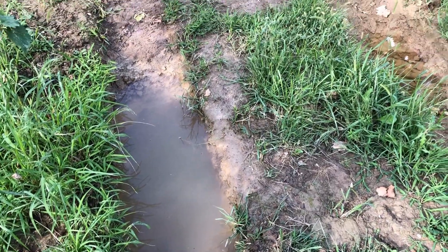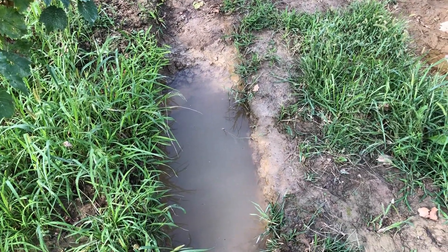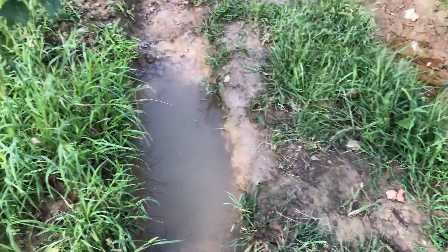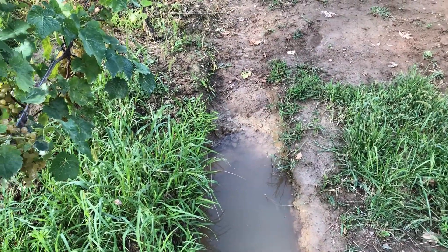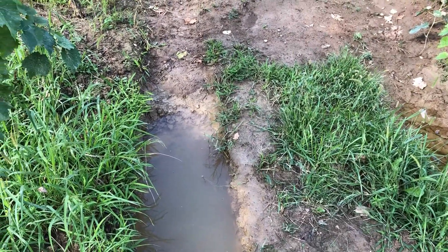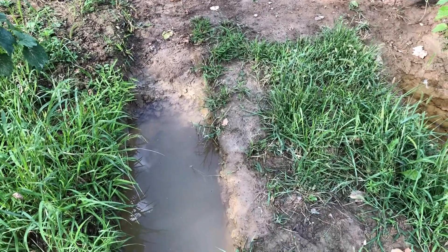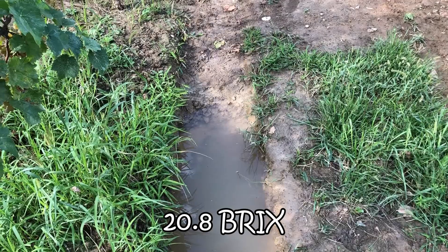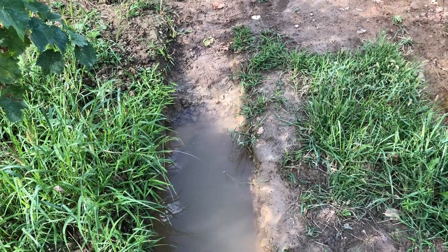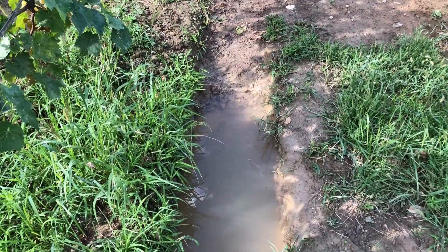I've had a ton of rain in the past week — about five inches — and it's not unusual for us to have that at this point in the summer and early fall in Ohio. But it is unfortunate because I'm afraid it's going to drive our brix down. If you're counting sugar content in a liquid, the more water you have diluting that number, the lower it's going to go. We tested last Friday and it was 20.8 brix, which was a composite of all the rows with different sizes, shapes, and maturity of grapes in that mix. We'll see what this kind of rain does to our number to compare.